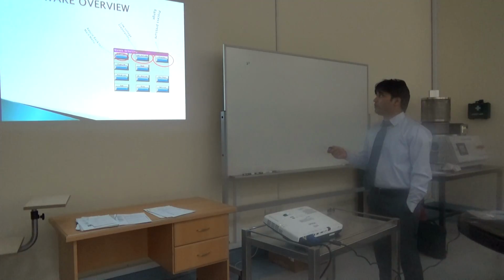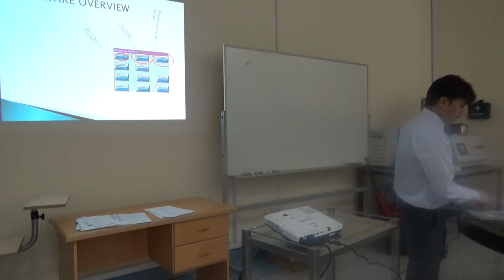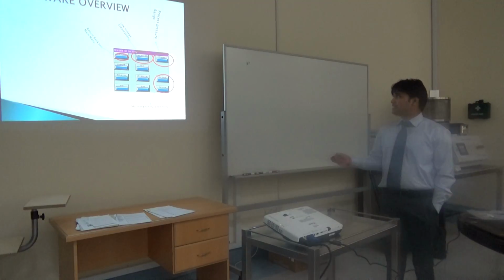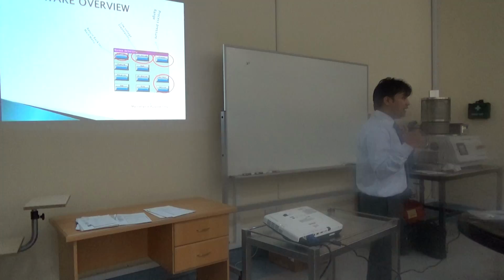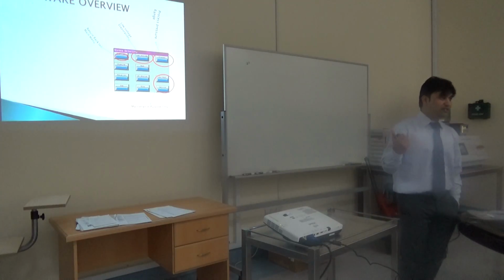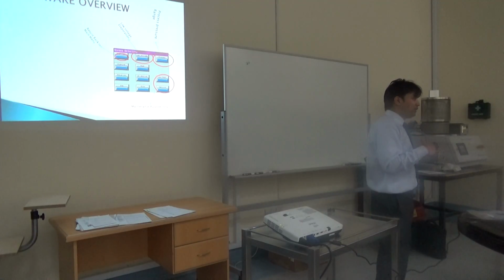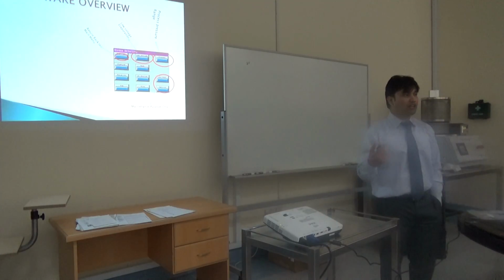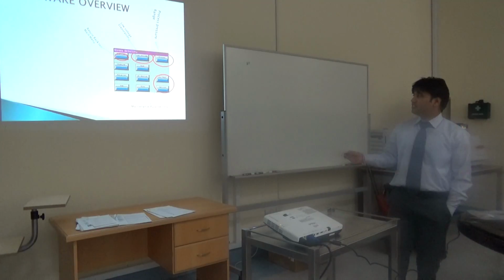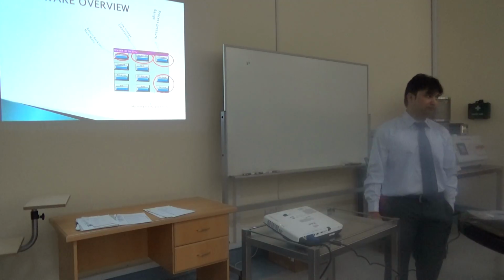Overview, if you touch this overview display, then it will return back to the main display. Next, about this PLC and the service touch screen. It's recommended not to play with these tabs, because if any interlock input is changed in the PLC and the service tab, then it will take a longer time to repair, because we have to check what was the correct input sensor used for controlling the process. This is only for service and maintenance purposes. That's why I put the red color, especially for these two tabs.